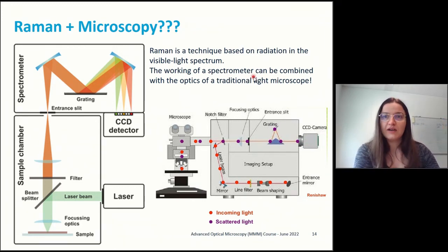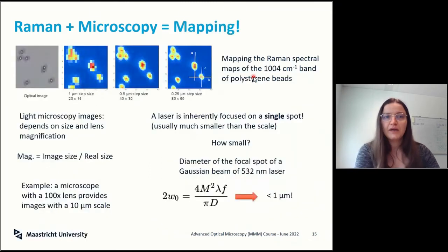With the fact that you can combine the microscopy and the Raman, when you have an instrument that is properly set up with a proper computer, you can combine what you see as an optical image and make it track the Raman signal. So you can just say, okay, now go into this whole thing and go step by step and collect me the Raman signal. Especially you could focus it at a specific energy.